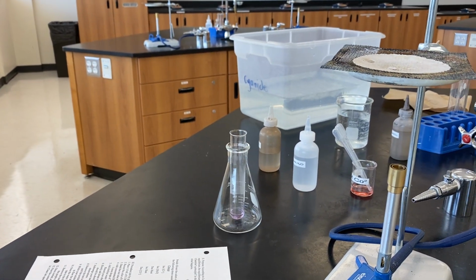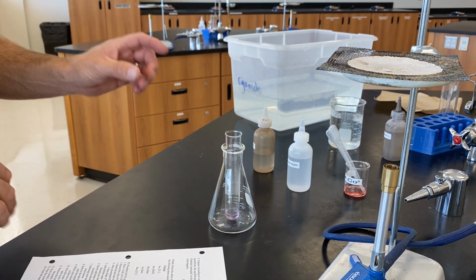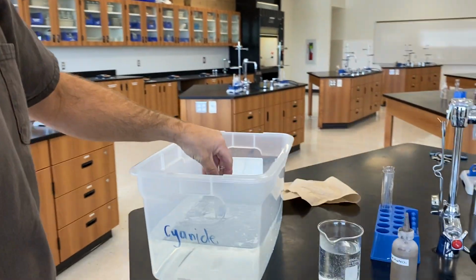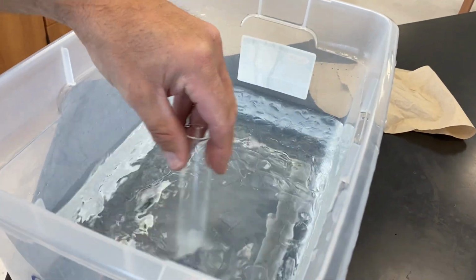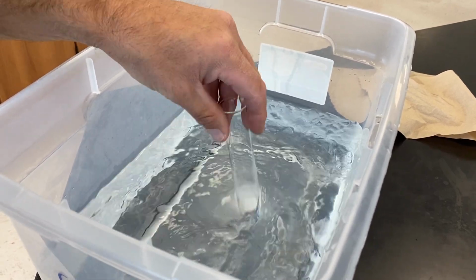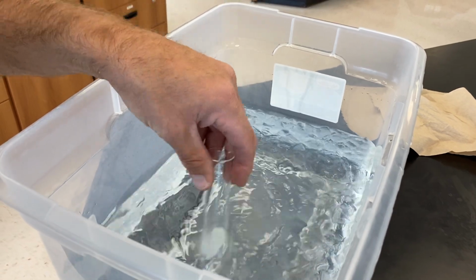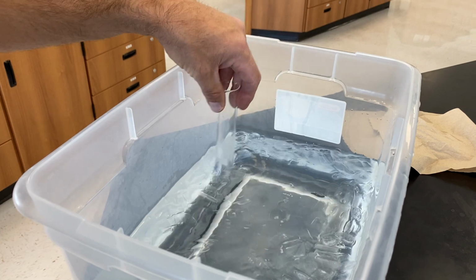We're now ready to get into step 7 and beyond, where we start to look at temperature changes. So in step 7, we are going to put this test tube in an ice bath. Swirl that around a little, get into that ice.